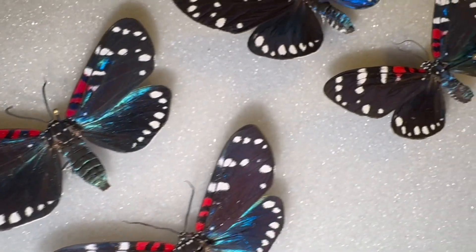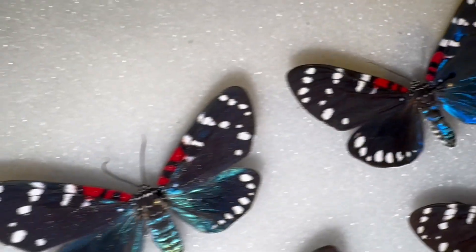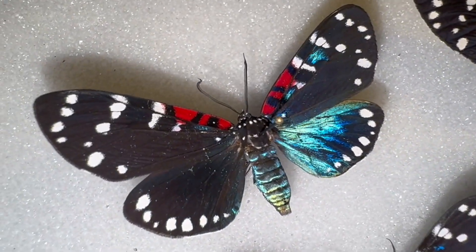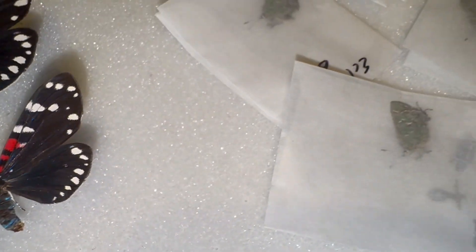Hey folks, David Fine here from Key's Moths. Today we're going to go over the best way to rehydrate dead, dried insect specimens. We're going to tackle this from two angles.